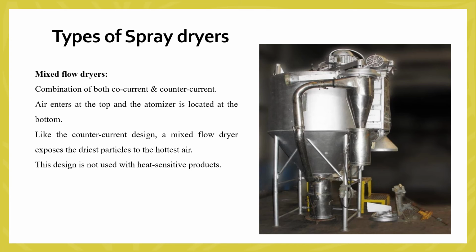Mixed flow dryers, a combination of both co-current and counter-current. Here the air enters at the top and the atomizer is located at the bottom. Like the counter-current design, a mixed flow dryer exposes the driest particles to the hottest air. This design is not suitable for heat-sensitive products.